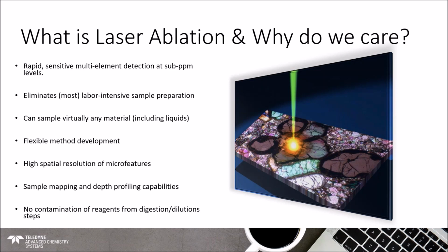I've already mentioned the spatial resolution that you're able to maintain with some applications. That's incredibly important. We talked about rocks before, or crystals within them, called zircons, which have growth rings similar to trees. If you want to be able to analyze the chemistry of the various growth rings, being able to do that through dissolution is impossible. If you use laser ablation in very small spot sizes, you can see each growth ring individually. You can see a tremendous amount of information and learn about that rock's magmatic process.